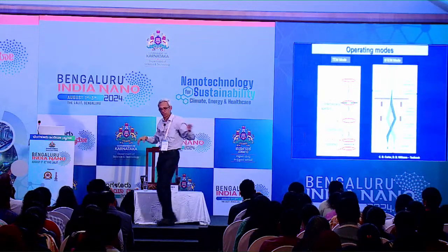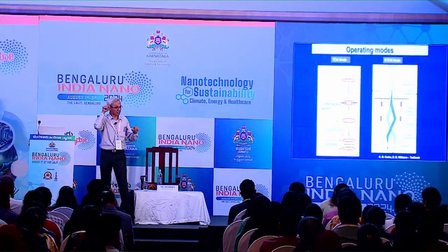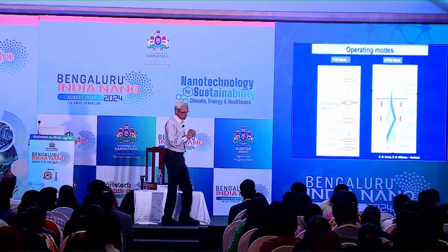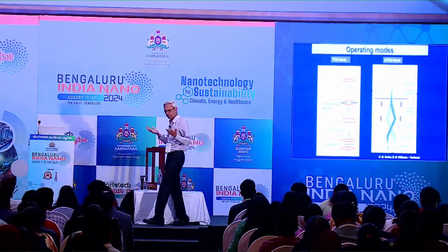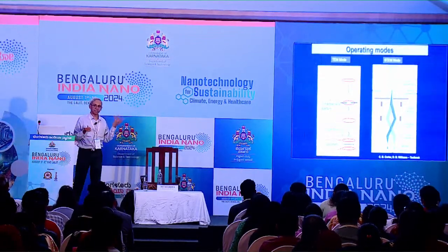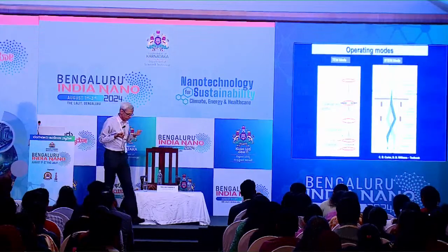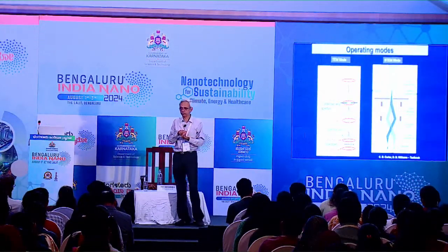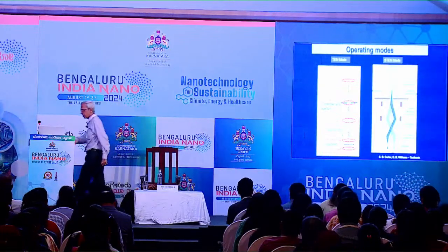Just like Chandrabhash showed you that schematic, we can actually see individual atomic columns. I'll show you several examples. The STEM mode has become particularly popular because, even compared to high resolution phase contrast, in the STEM mode the interpretation is much more straightforward. So I will show you.